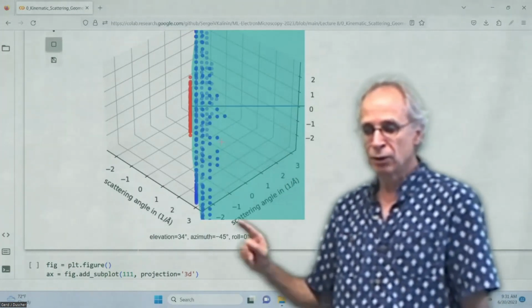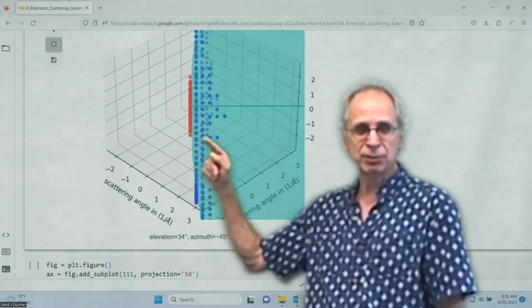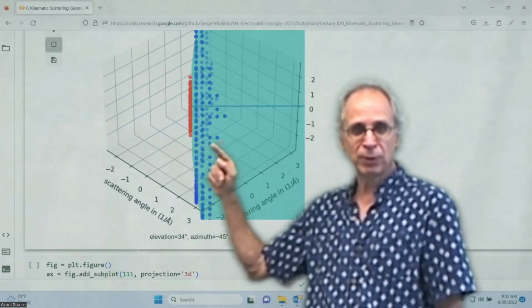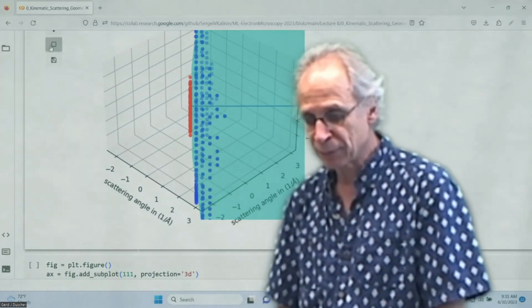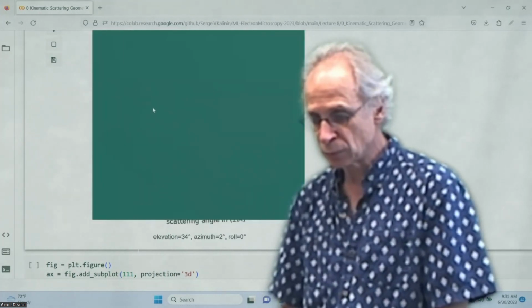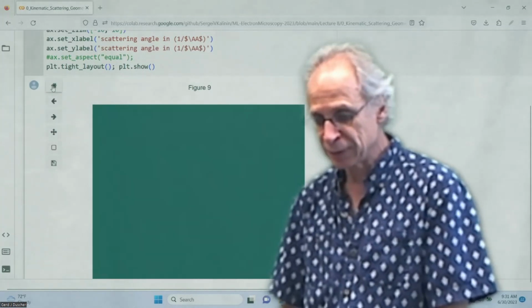Okay, so we see on the Ewald sphere we have the zero order Laue zone, and then as we go out in the reciprocal space, we also get the other ones. I say out, so let's tilt that thing. Okay. Let's go back.